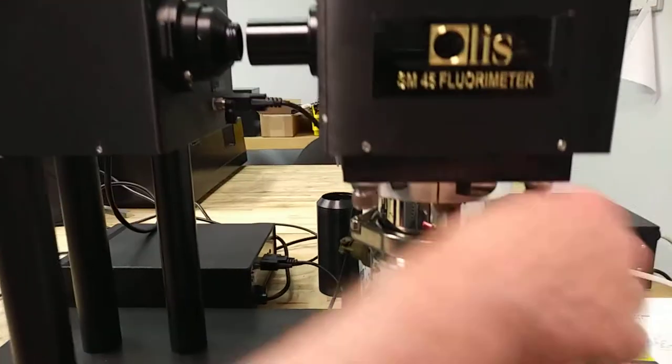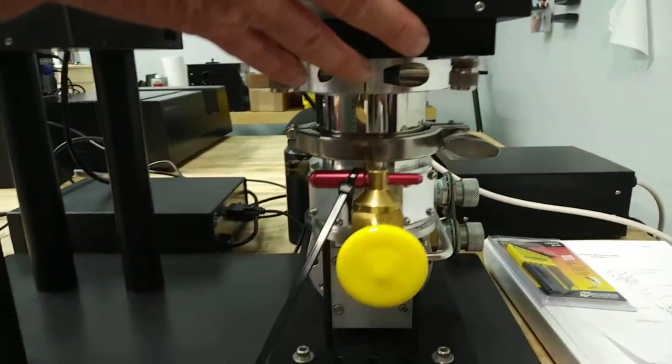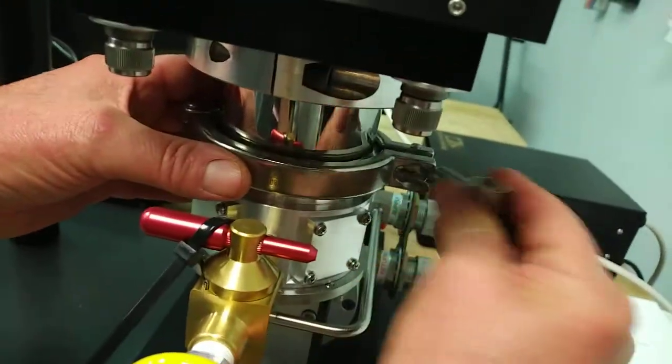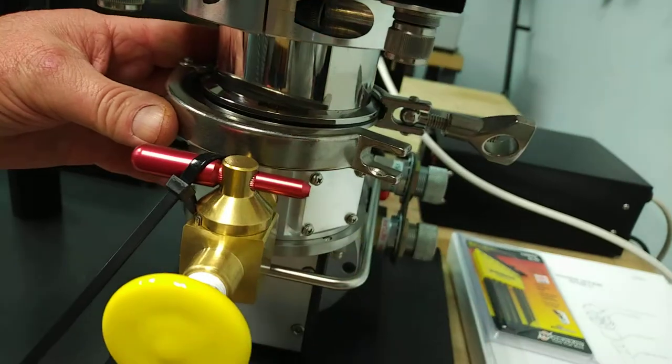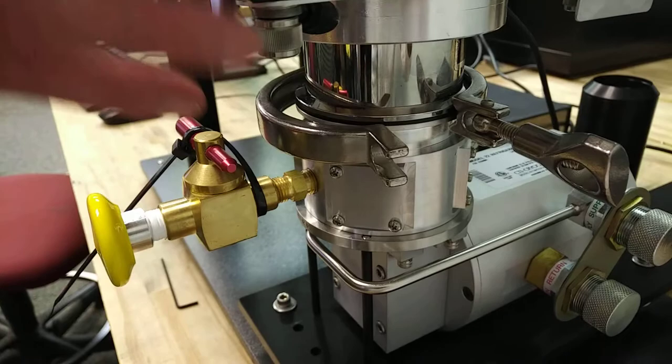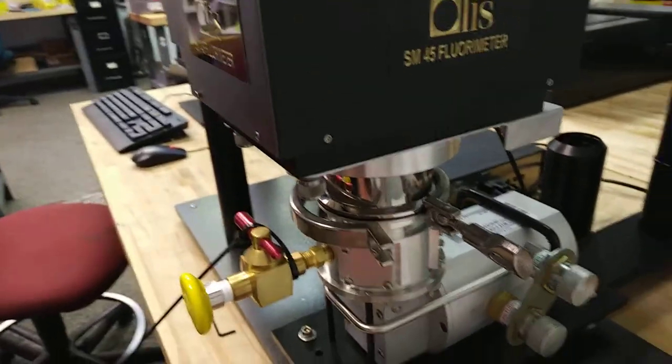And then you remove this clamp — you're just rotating that. Right, you rotate it and this clamp comes off. And then the vacuum shroud comes off as described in the Janis manual.